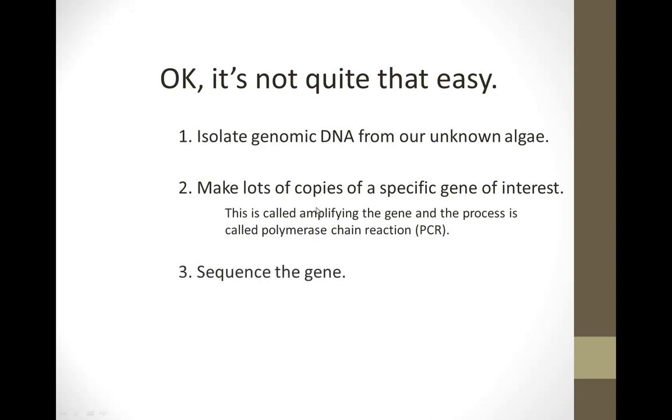Once we have billions of copies of our gene of interest, we're going to send that out for sequencing. We don't have quite the right equipment on campus to do the sequencing ourselves, and it's much easier for labs that just, this is all they do is sequence DNA. So they can do it for us in a week. We'll get the sequence back from them.